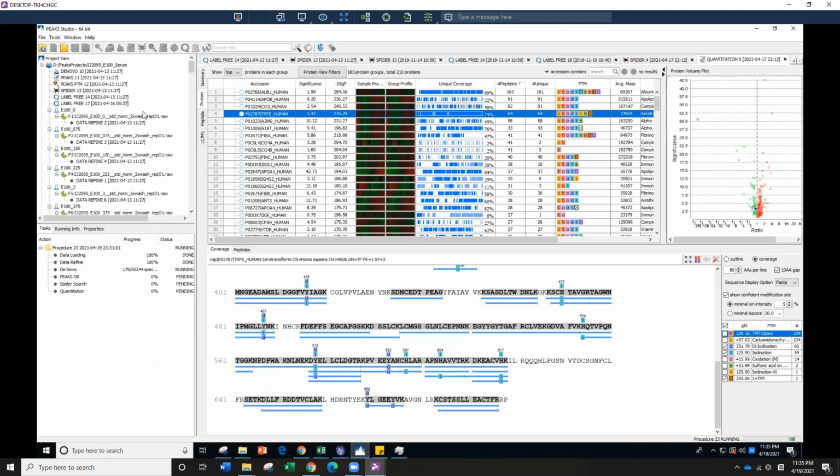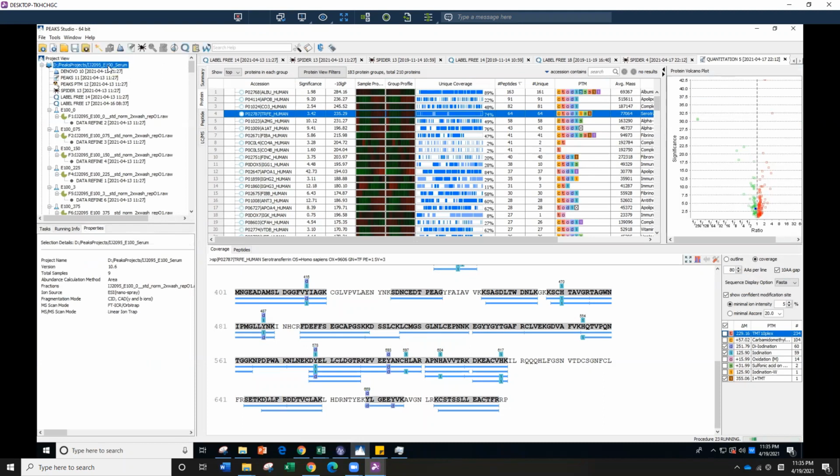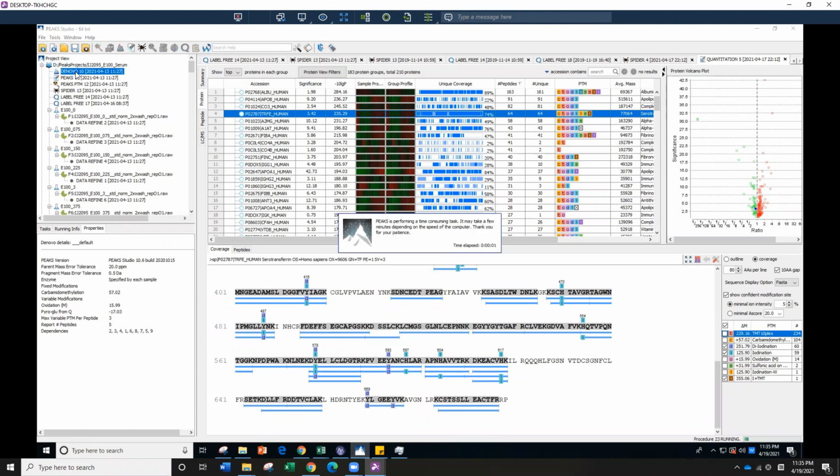Okay, so today I'm going to go through voting data and go into a couple of steps of what we're going to see from the analysis. Here, de novo is the first step of the analysis. I'm sure I did not open this one before, so it might take a while for it to open up.